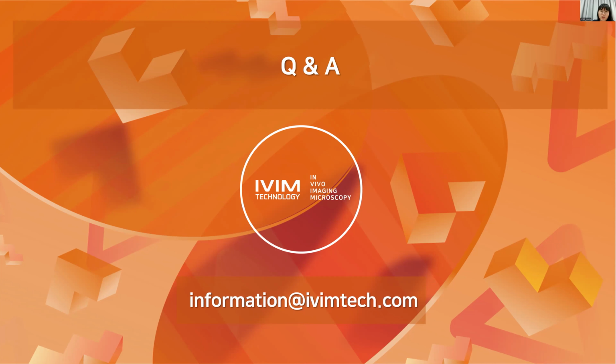And the next question is, are there applications in bone repair, wound imaging by IVM? Yes, actually, several months ago, we had one published paper regarding osteoclast imaging with a 2-photon microscope within the mouse bone. So if you want to get the information about the paper, we can send you the theme and the name of the paper for you.